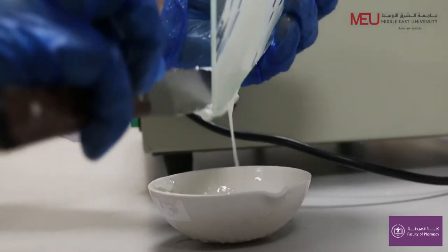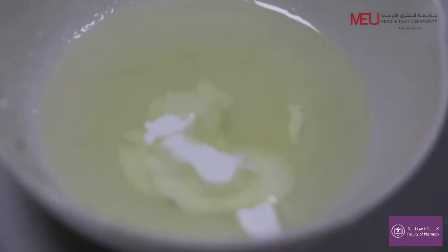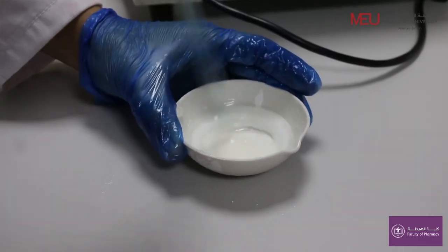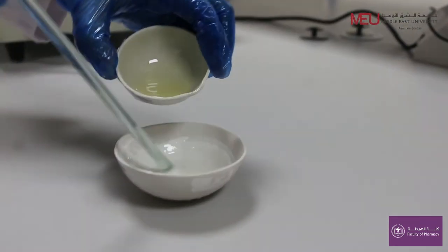Transfer them to the dish containing the melted ingredients, taking care to leave virtually no material on the tile. Mix well. Add the rest of the castor oil and stir until cold.